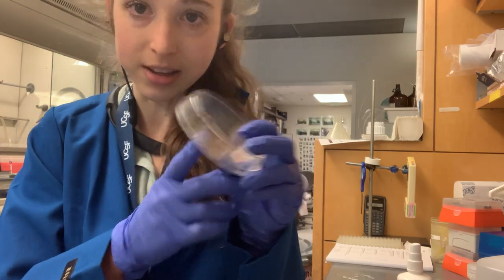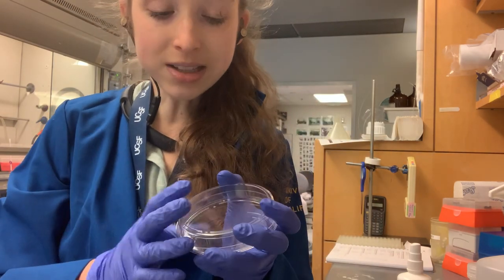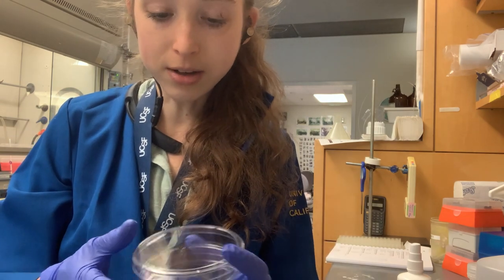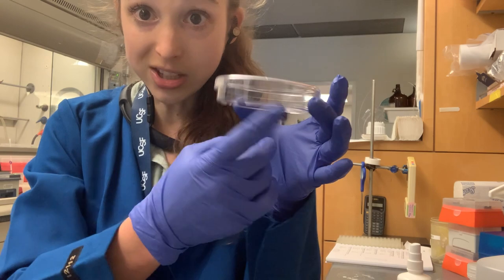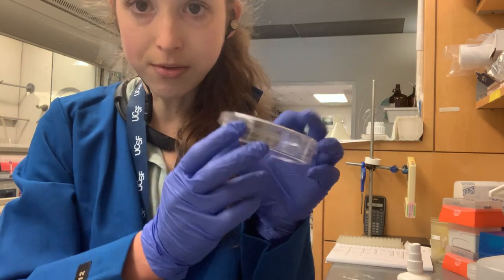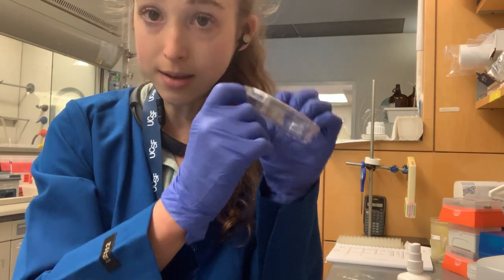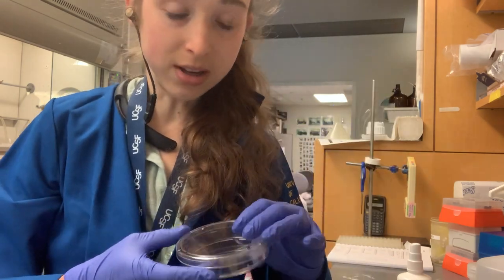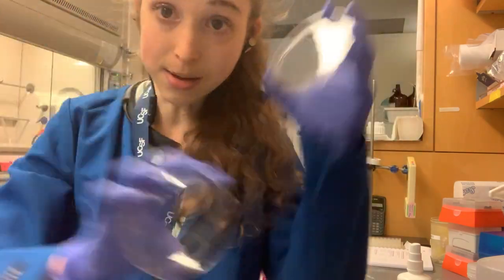But if you're working with mammalian cells, you have to be really careful. If you're doing a cell culture where you have to keep the plates right-side up because you have liquid, now you have to write on the top of the lid. Maybe put some sort of mark on the side as well so you can reference between the top and bottom of the dish.